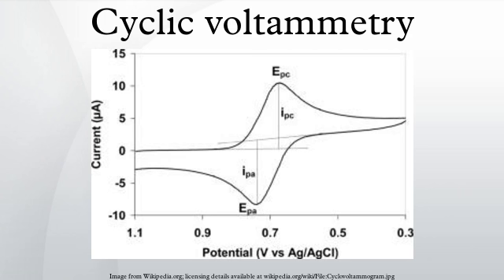It was observed that cocoa powder and dark chocolate had the highest antioxidant capacity since they had high total phenolic and flavonoid content. Milk chocolate had the lowest capacity as it had the lowest phenolic and flavonoid content. While the antioxidant content was given using the cyclic voltammetry anodic peaks, HPLC must then be used to determine the purity of catechins and procyanidin in cocoa powder, dark chocolate, and milk chocolate.